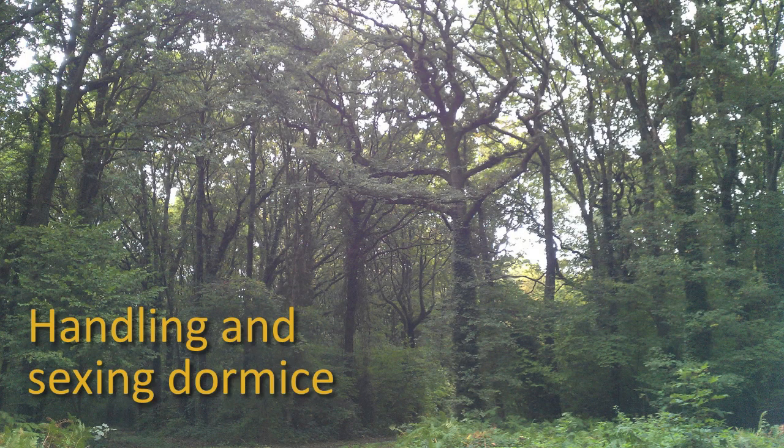This is one of a series of videos from People's Trust for Endangered Species on how to undertake a box check for the National Dormouse Monitoring Program, and it deals with how to handle and sex dormice.